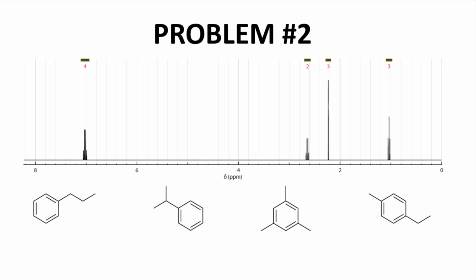Now, let's look down here at this 4 hydrogen signal. And this may not be one signal, maybe it's something overlapping, but notice it's at about 7 ppm between this 6 and 8 window. That's an aromatic ring. And of course, if we look below the spectrum, we see lots of aromatic rings. Now, the integration can be extremely helpful.